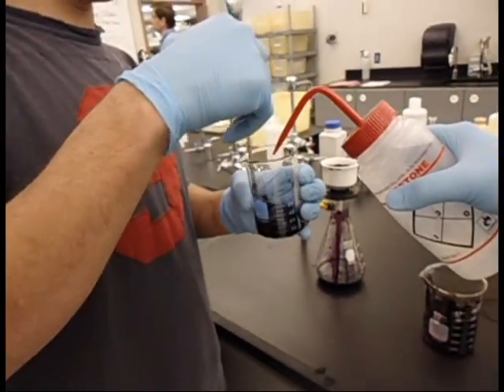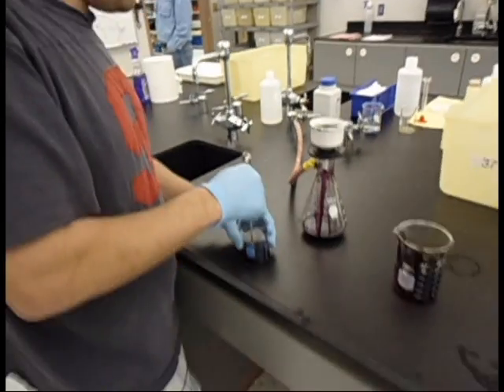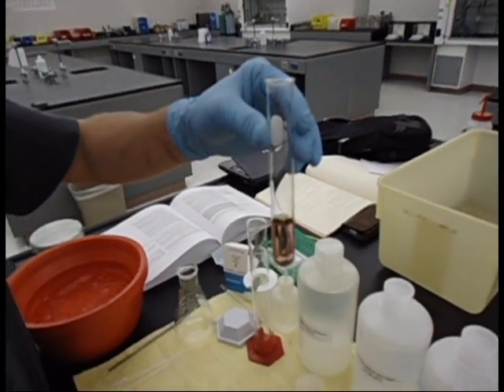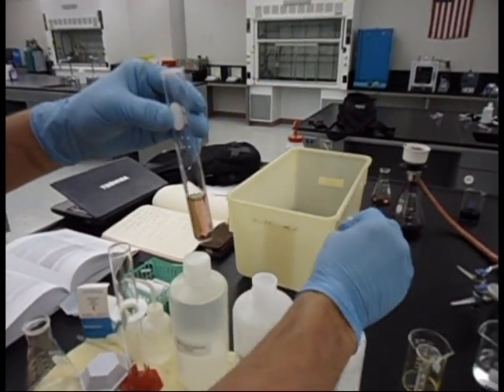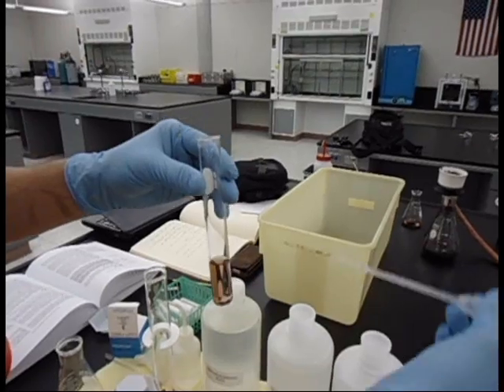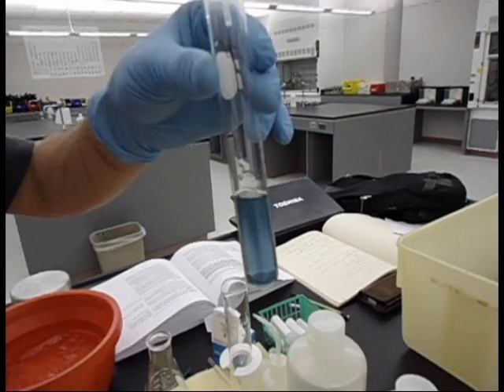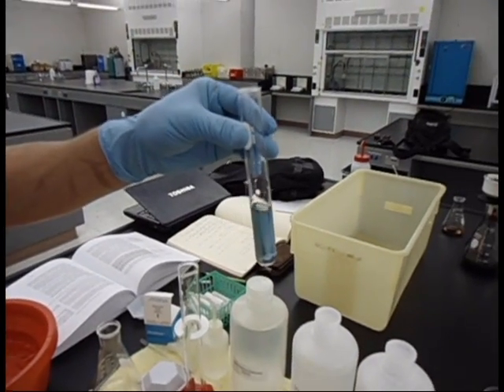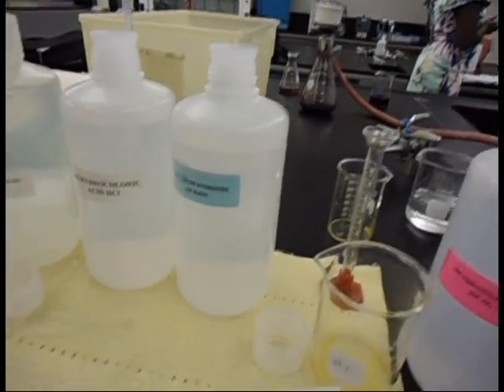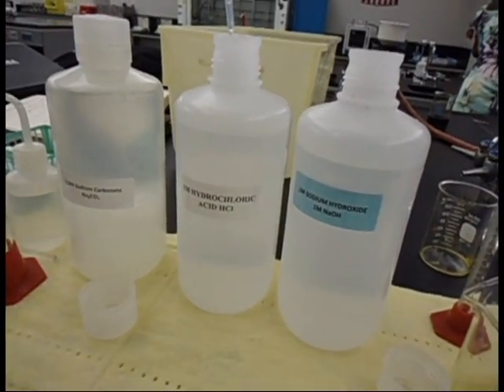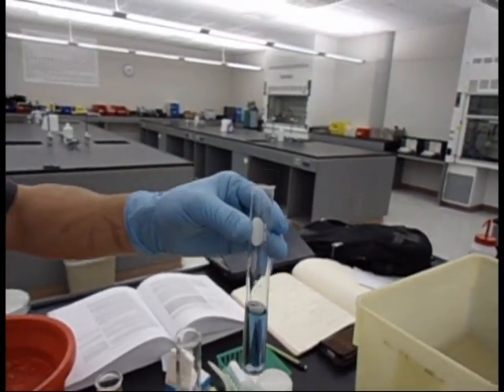We're going to show a fun property of the dye. We're going to add some base first and change the color. You can see a nice blue color forming. Now if we add some acid—the base was one molar sodium hydroxide and this is one molar hydrochloric acid—we're going to add that in there and it should turn a nice yellow color.